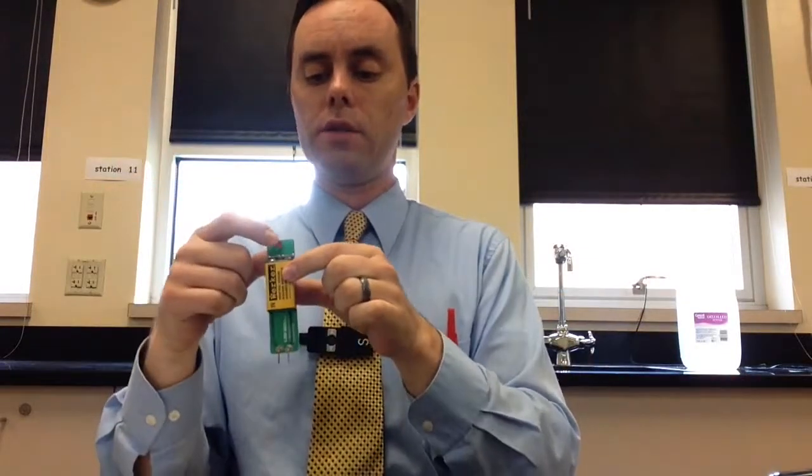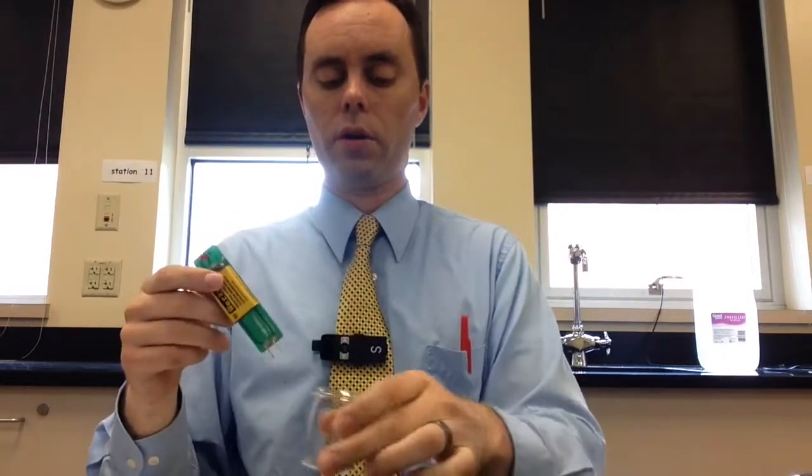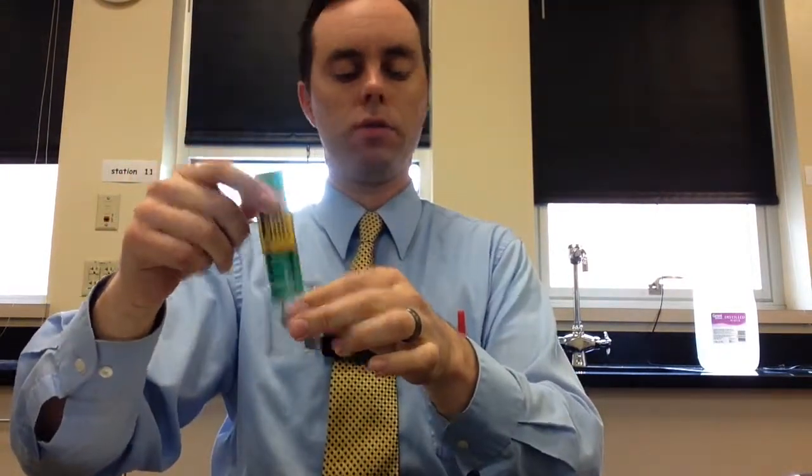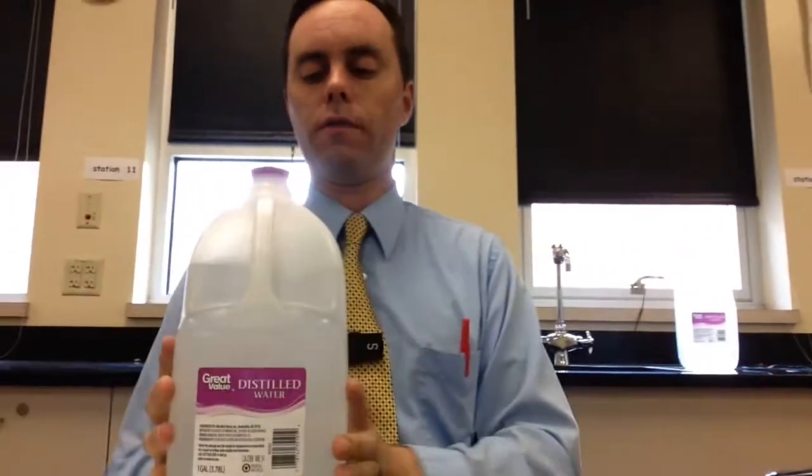If it's conductive, this little LED, light emitting diode at the top, will turn red. It'll start glowing. And you'll do the same thing with the sugar and then record those results. At that point in time, you're going to move on to the next step, which is to add to the dry components that you've got in there about 10 milliliters of this stuff.